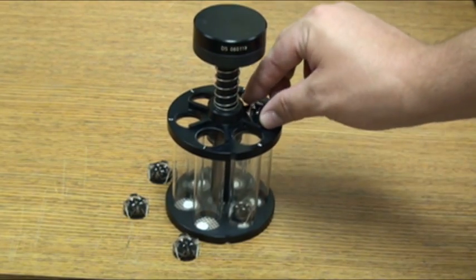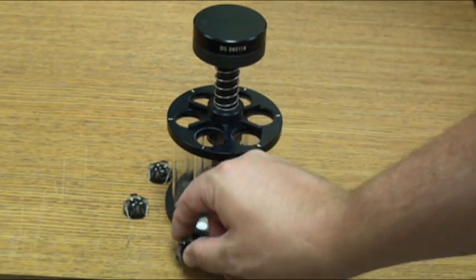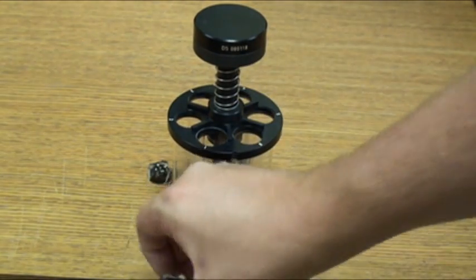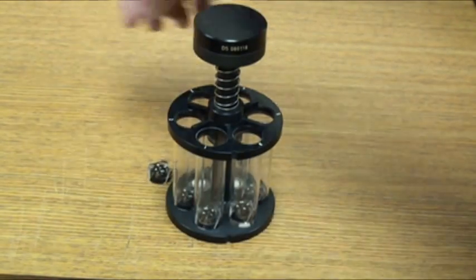The discs are embedded with a copper ring internally, which, coupled with the electronics inside the basket, make a magnetic field in each separate chamber.